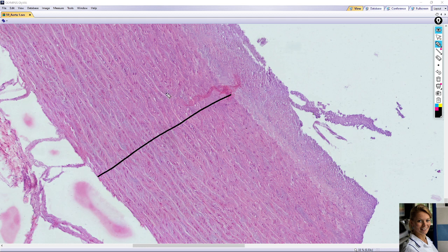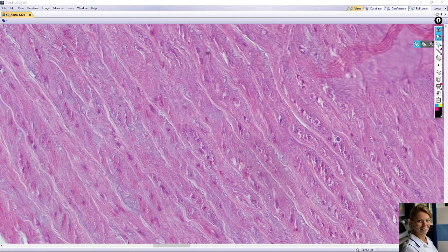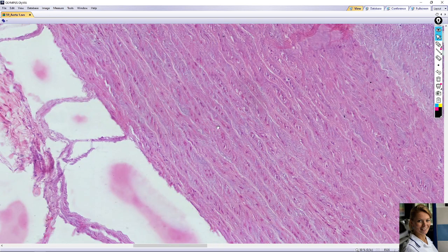Collagen fibers are also present in the tunica media. You can see nuclei of smooth muscle cells — for example here and here — which produce extracellular matrix in the tunica media. Here is an elastic membrane in tunica media, with nuclei of smooth muscle cells and collagen fibers between the smooth muscle cells and elastic membrane. This is the pattern which is repeated in the tunica media.